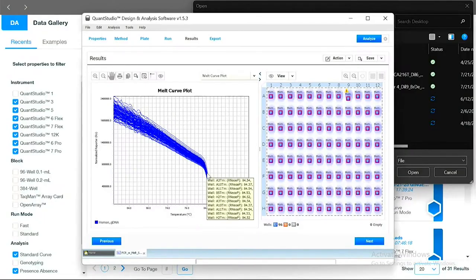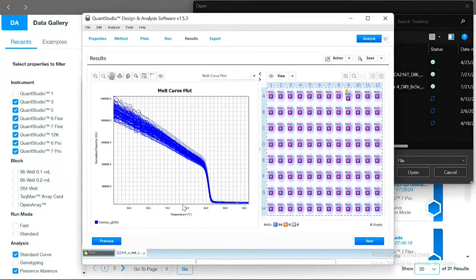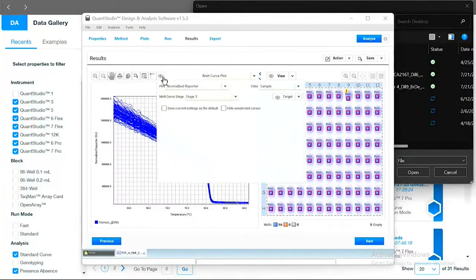That's where everything just, I'm done. And then we get to a very low point of fluorescence where everything is single-stranded. It's hard to determine that Tm accurately in this linear plot. So we take the first derivative to figure out where the maximum change happens, and that is here.